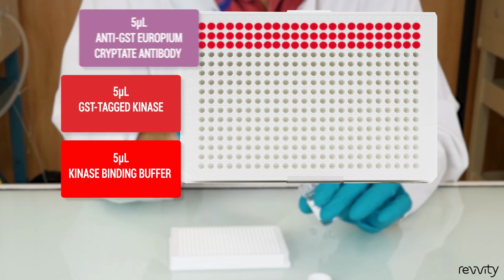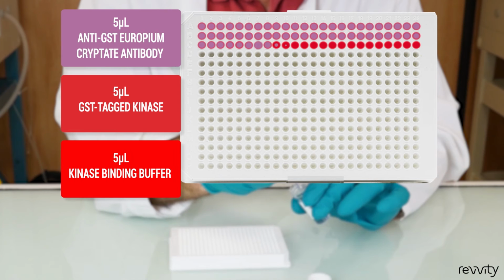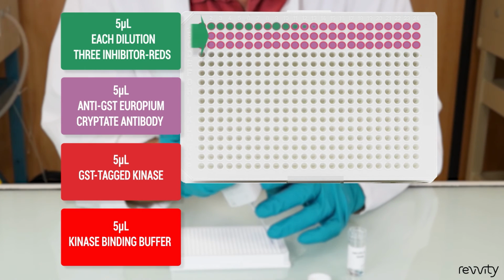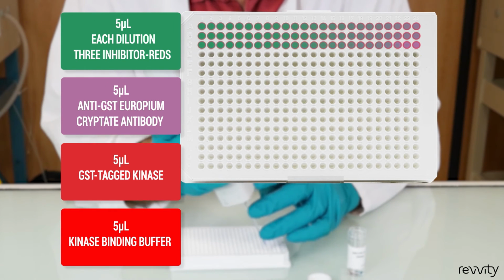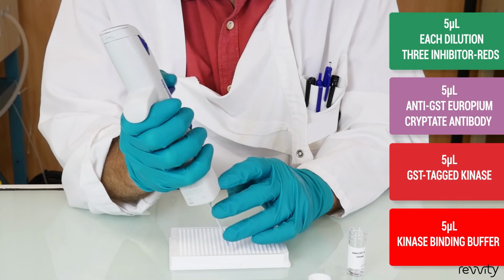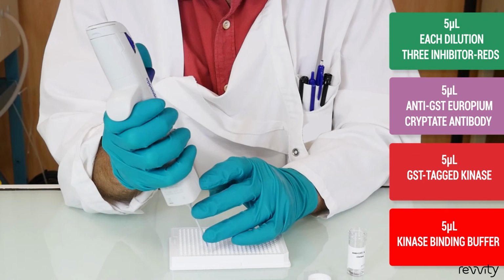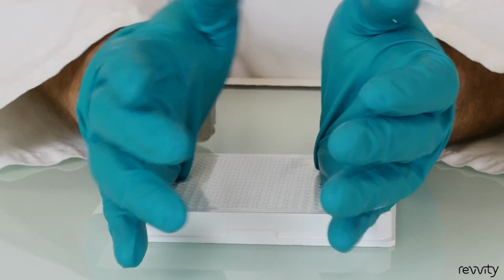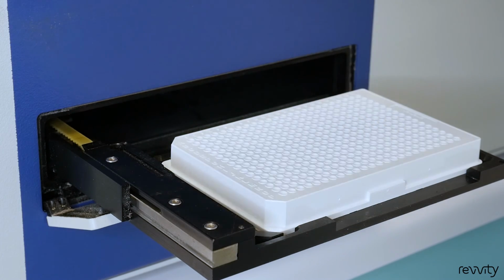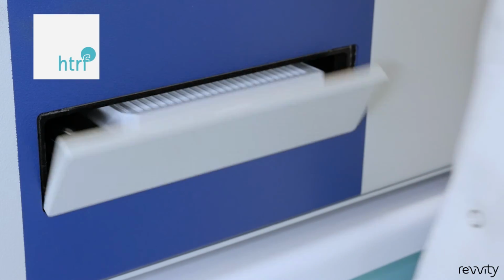Add 5 microliters of anti-GST europium cryptate antibody to all wells, followed by 5 microliters of each dilution of each of the 3 inhibitor reds in the corresponding wells. Seal the plate and incubate for 1 hour at room temperature. Remove the plate sealer and read using an HTRF compatible reader.